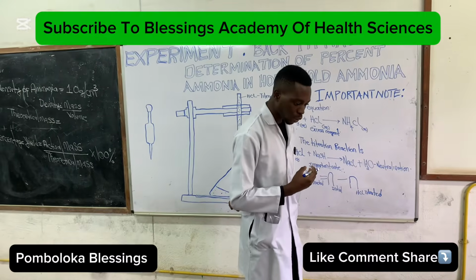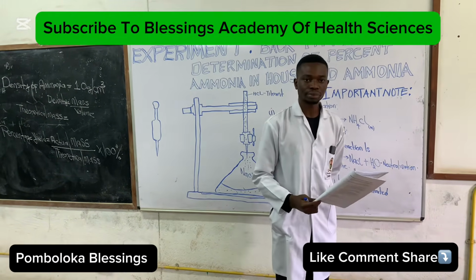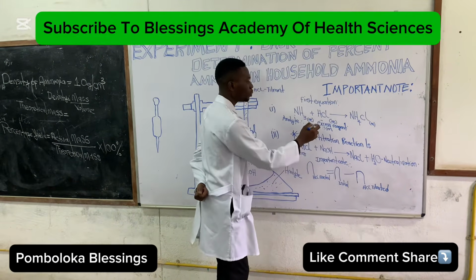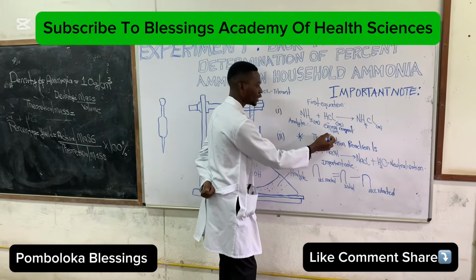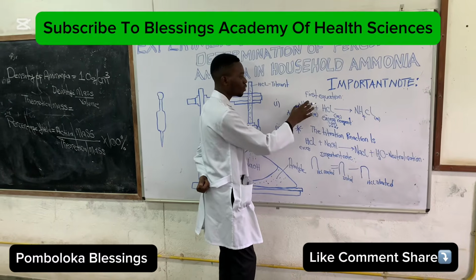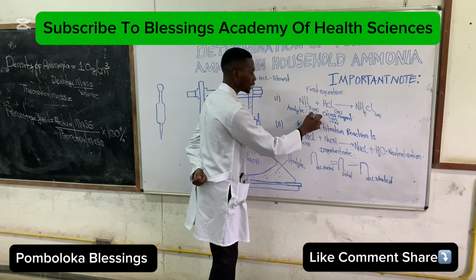When you get back to your lab manual, you discover we were given the concentration of the HCl as 0.1. So the concentration of the HCl here is 0.1 molar. You're also given the volume, which has already been given in your lab manual: you're mixing 25 mL of this. The volume of the ammonia has been given as 5 cubic centimeters, but the concentration has not been given.